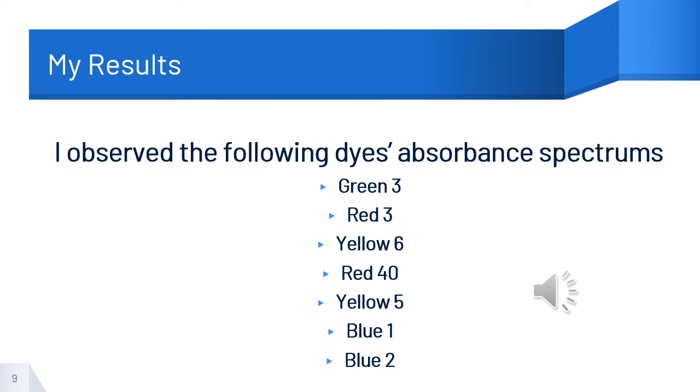The absorbance spectra that I analyzed were from dyes green 3, red 3, yellow 6, red 40, yellow 5, blue 1, and blue 2. On the following slides are the spectrographs of each dye.